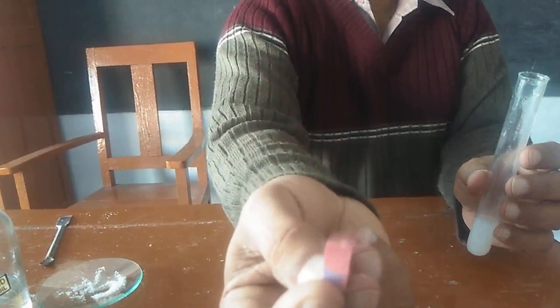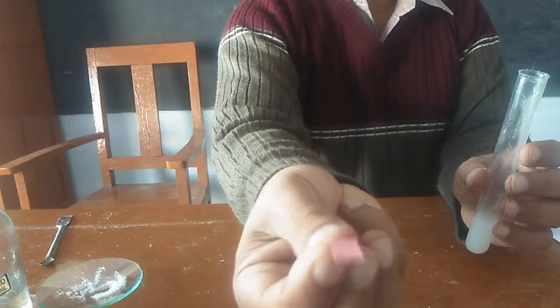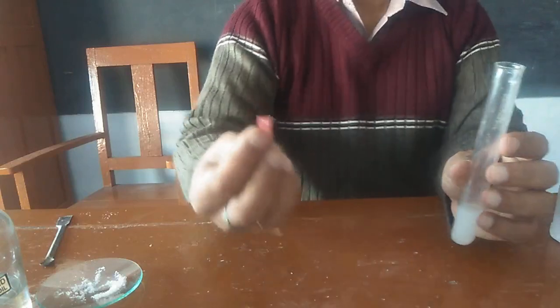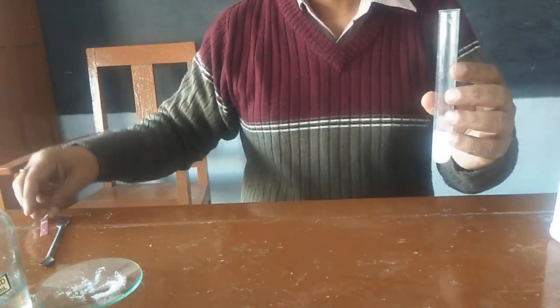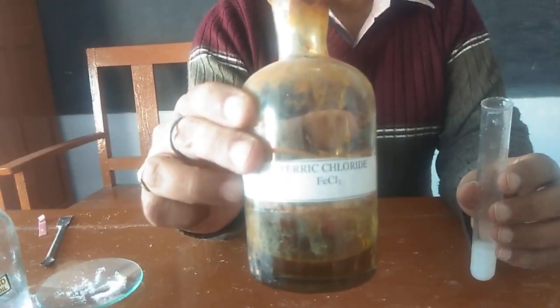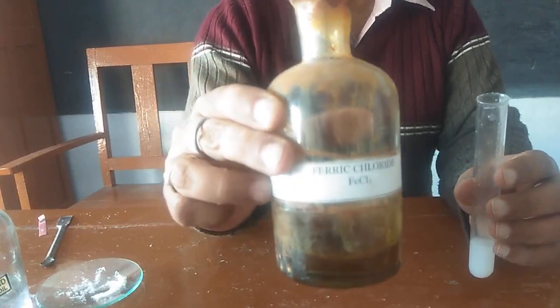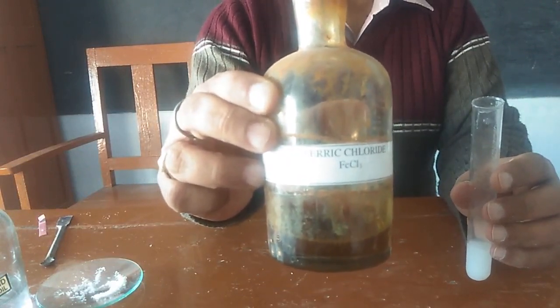So the presence of acids can be tested with litmus paper. Acid turns blue litmus to red and bases turn red litmus to blue. The confirmatory test for acetate is done with the help of neutral FeCl3.